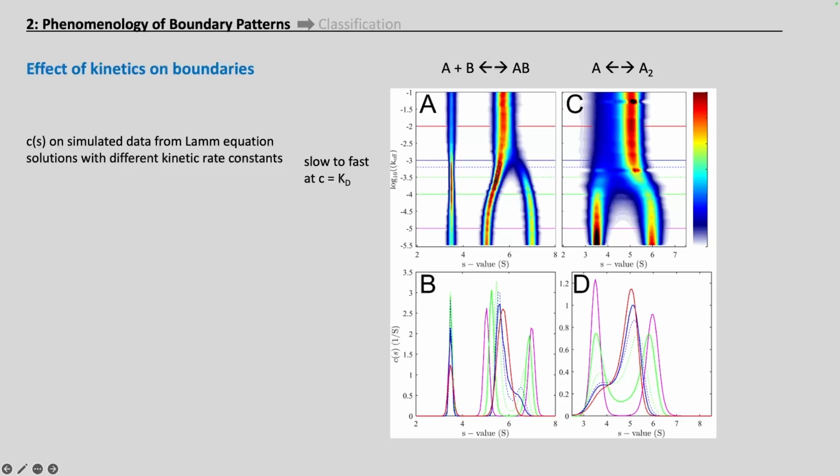Furthermore, we can recognize that the transition between these two sedimentation modes happens over a quite narrow range of kinetic rate constants, when the complex lifetimes are just about 10 minutes to half an hour, or k of between 10 to the minus 3 and 10 to the minus 4 per second. Now, this transition would change a little bit if we were to use very different rotor speeds. We can already see that there is little hope to determine off-rate constants from our sedimentation experiment outside this narrow range.